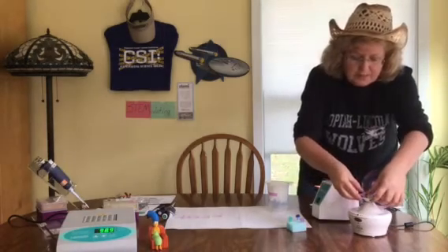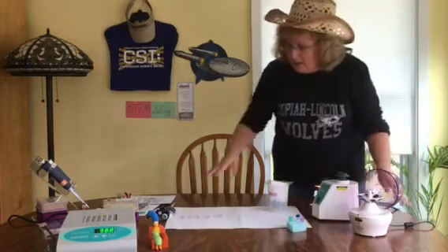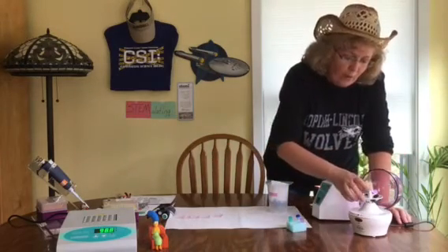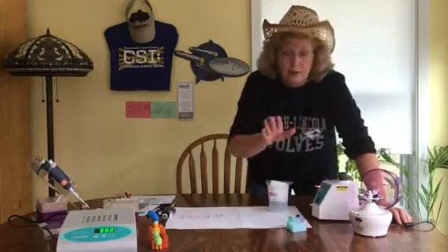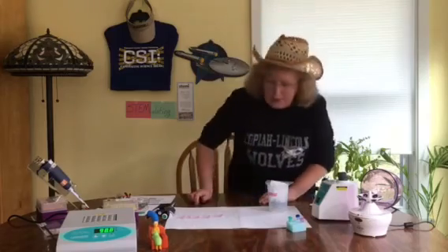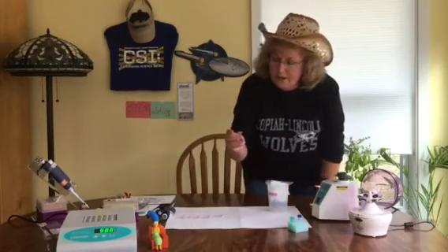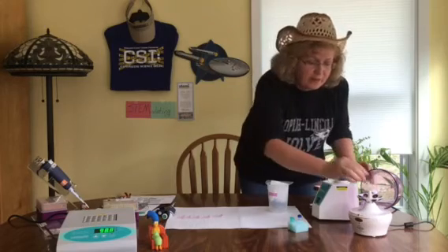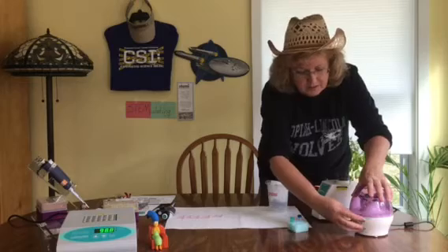I always put them in the same way. For example, I have the hinge pointing out. If I did the remaining 4, I have 1 slot left open. Is that okay? No. You always make sure everything is balanced in a microfuge. That baby's going to be spinning at 14,000 rounds per minute. You do not want it off balance. You just get an empty tube, put some water in it of about the same volume, and balance it.